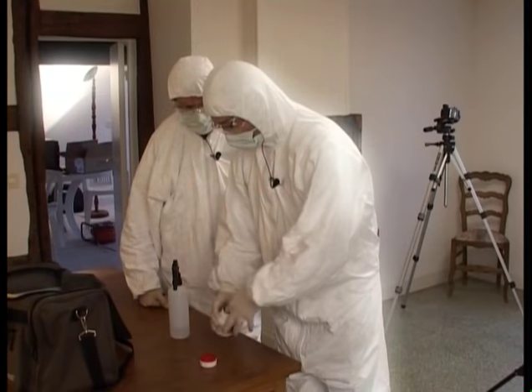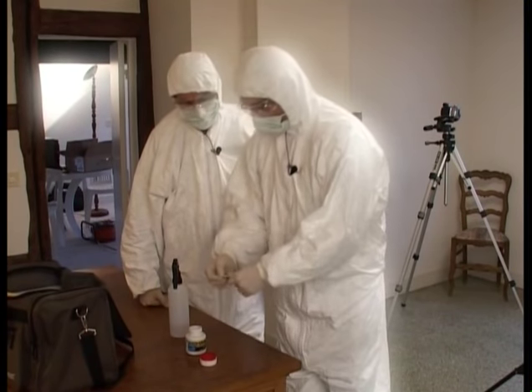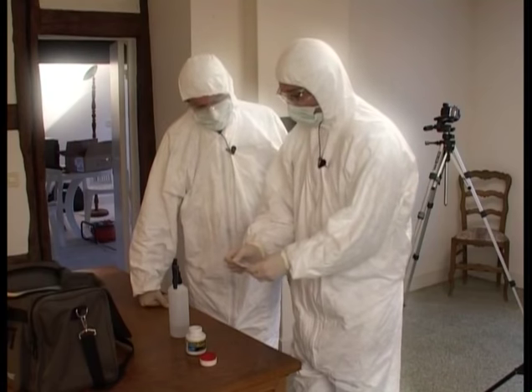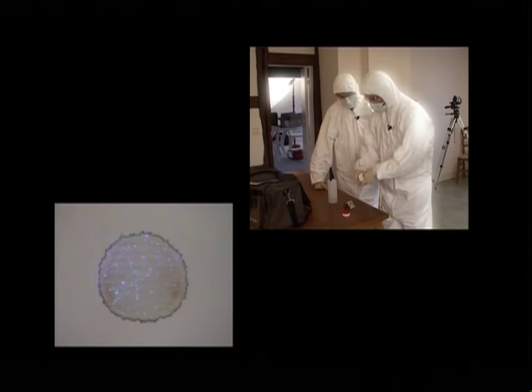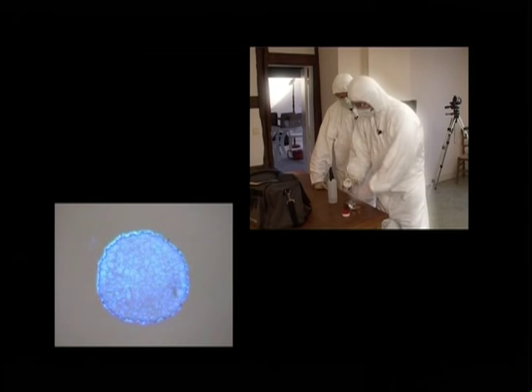Yes, of course. Because we're going to have a solution with a manufacturing problem which would result in the product not working. So you must make sure before using it. We take a medium that we know carries blood and spray it just to check that the solution is working. That's what we call a positive test.